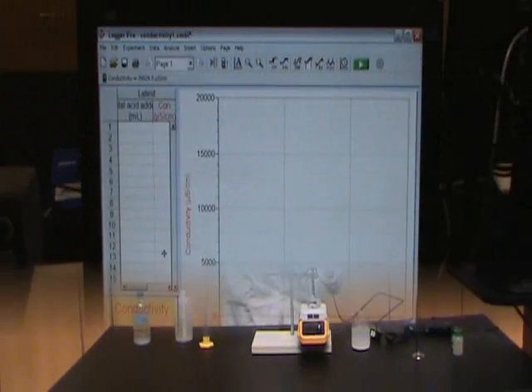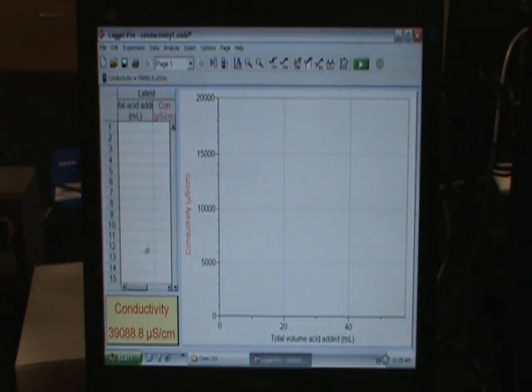So our initial solution is pretty darn conductive. It's 39,000 microsiemens per centimeter, so it's got a huge conductivity, but we'll have to see what happens as we start the experiment.